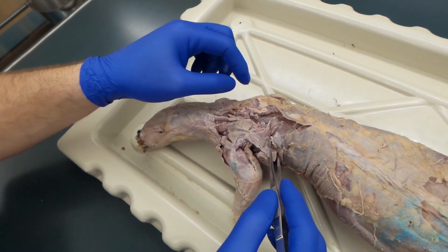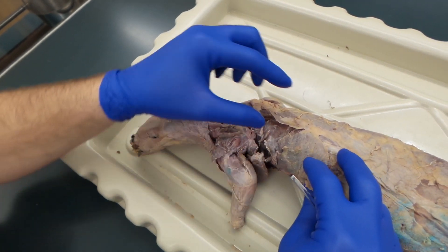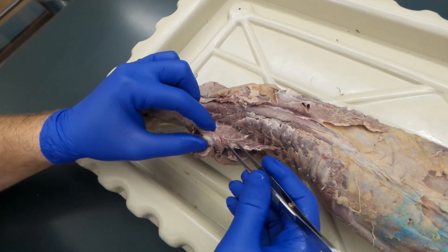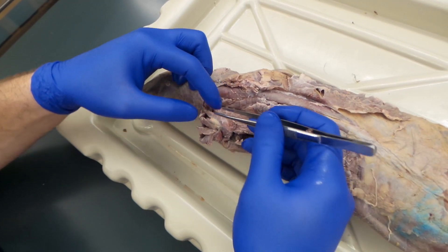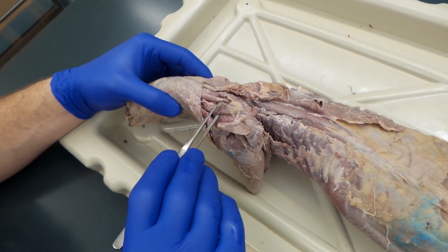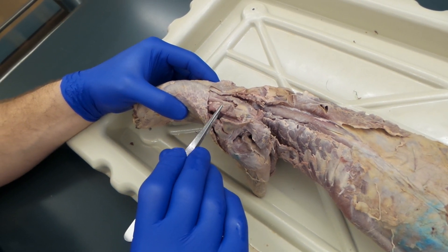There's the spinodeltoid. You cut your spino and acromiotrapezius last week. You also lifted the latissimus dorsi, and we kind of pulled the arm down, and we also looked at the rhomboids. So that's rhomboideus major, rhomboideus minor.